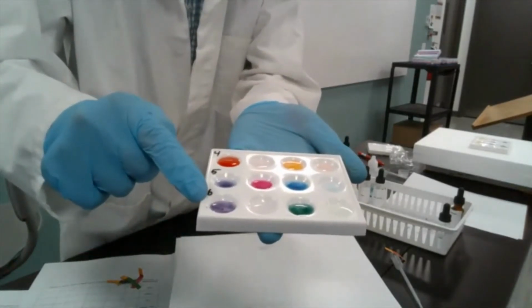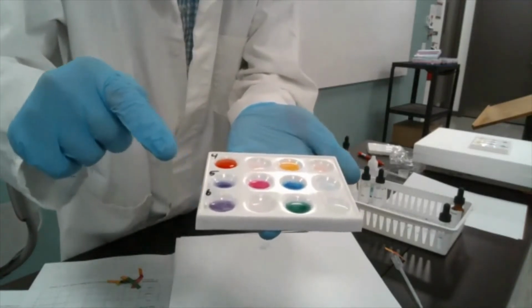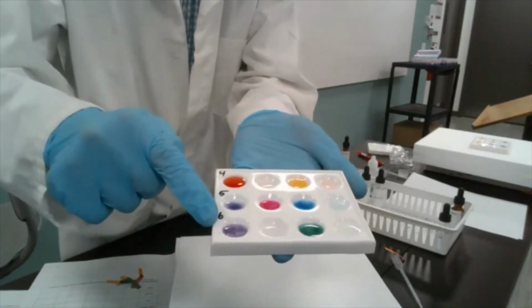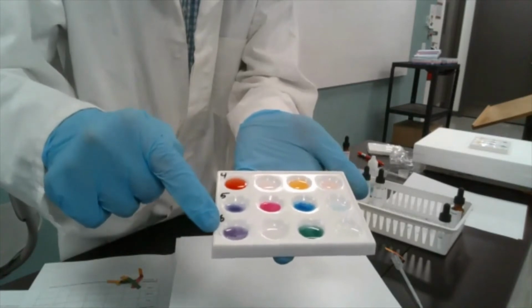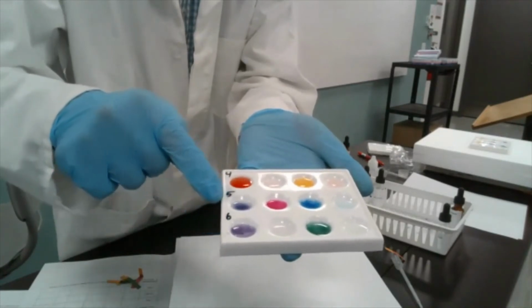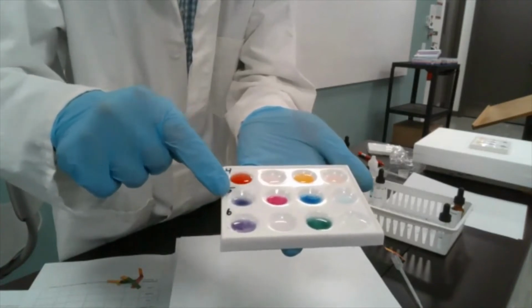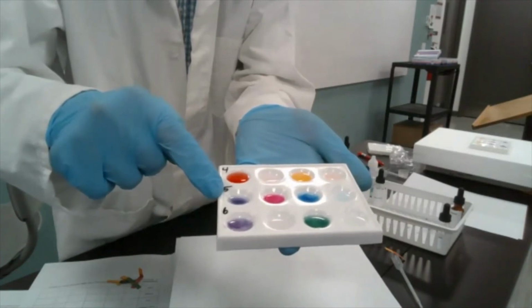Now, bromothymol blue, blue litmus, because this is the first one that we're doing, you've seen that it's blue. It's remained blue, but there's a slightly purple hint to it compared to the actual blue of the basic glass cleaner.